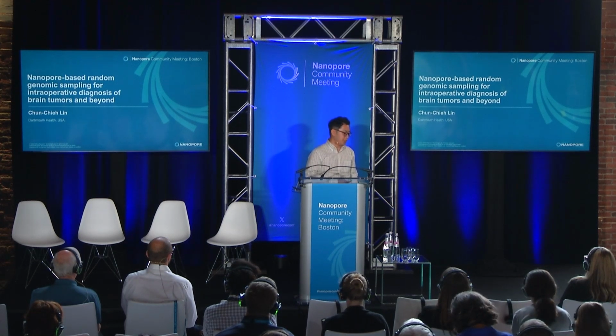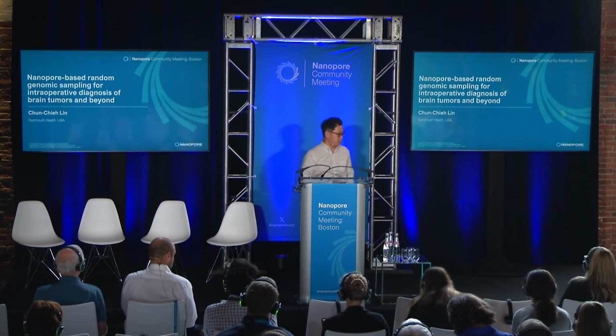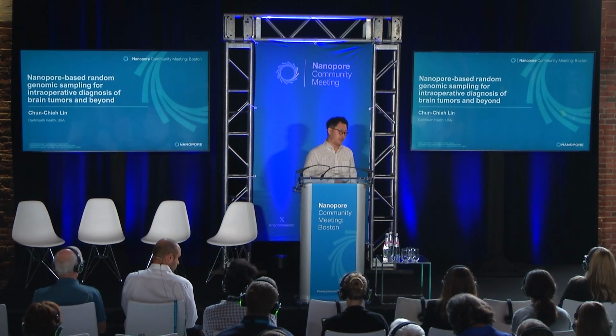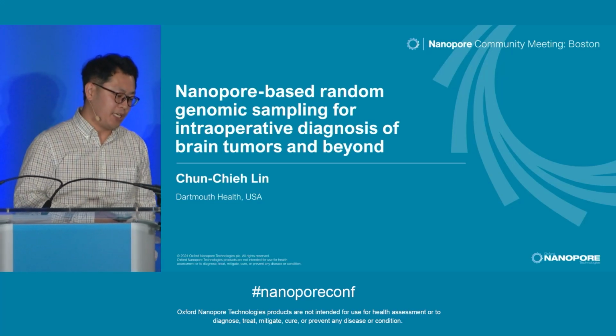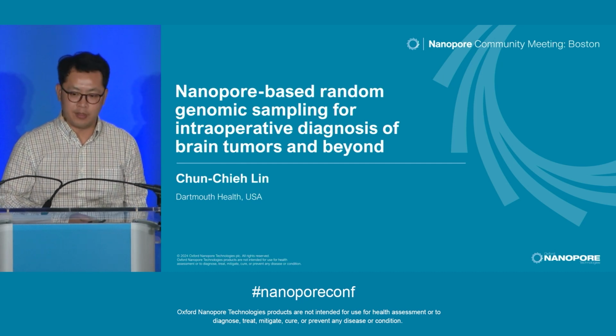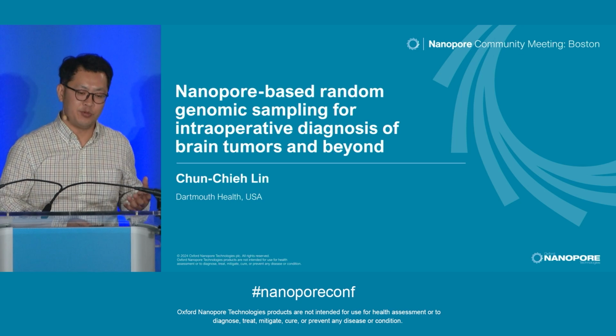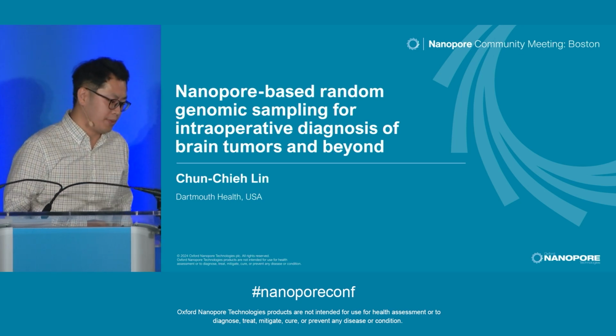I'll be talking about the intraoperative molecular diagnosis of brain tumors and beyond, and some other tumor types. Just to define the molecular, we are going to talk about copy number alteration and methylation profiling. Intraoperative is a vague term, but right now, if we are dealing with craniotomy, within like 2 hours is a very reasonable time frame.